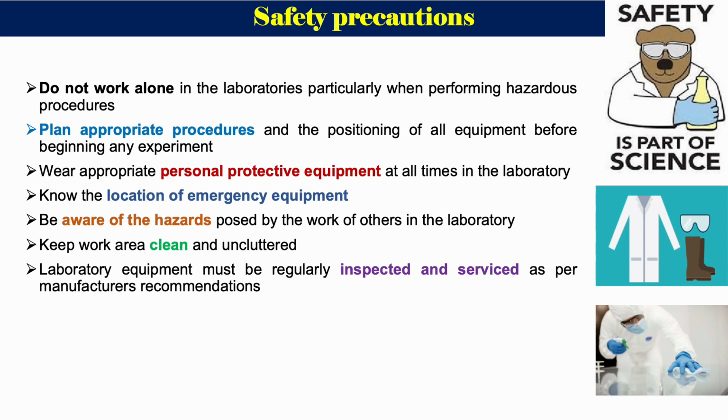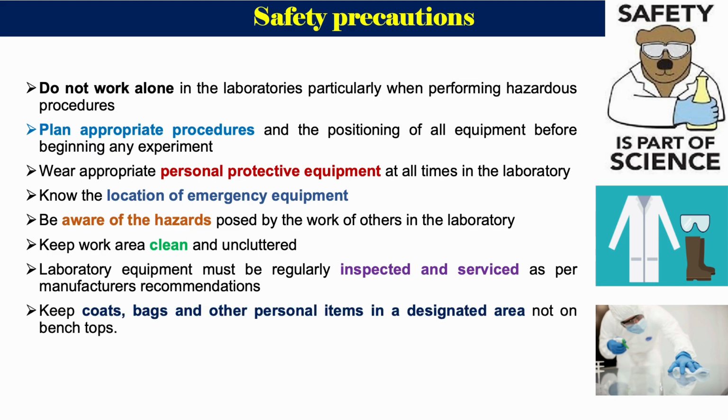Please keep your work area clean and uncluttered. Laboratory equipment must be regularly inspected and serviced as per the manufacturer's recommendations. Please keep coats, bags, and other personal items in the designated area, but not on the bench top. Please try to remember, safety is part of science.